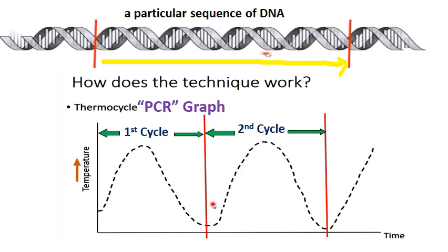Such biochemical reactions or PCR mixtures are completed in cycles, as shown in this figure, which reveals the relationship between temperature, increase or decrease, and the time of that thermocycle reaction.